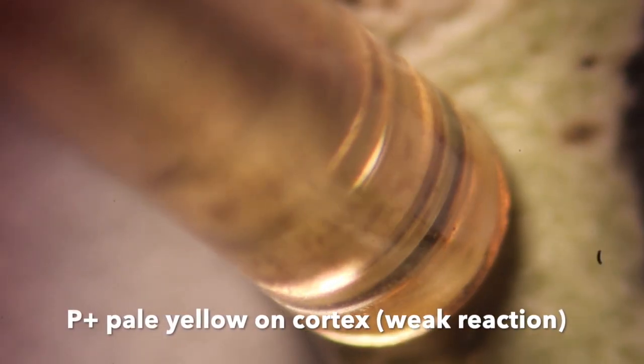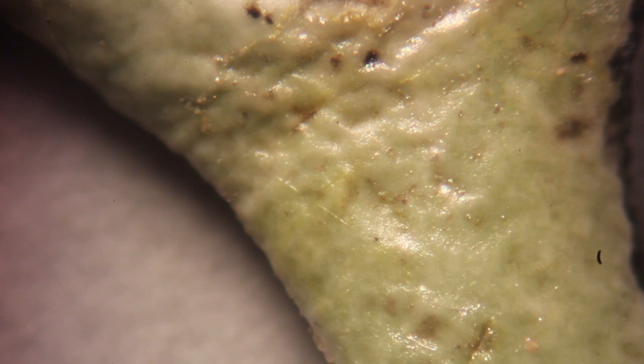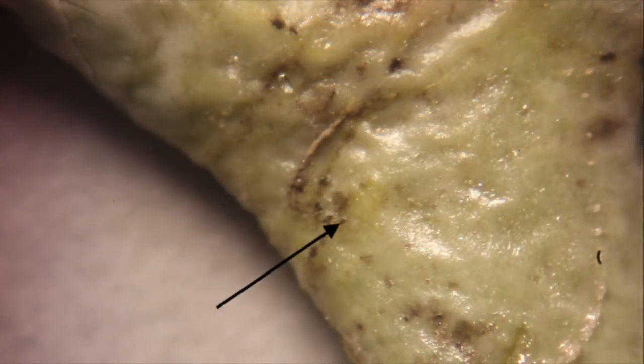Some reactions are weaker than others. In this case, we have a P plus pale yellow reaction on the cortex. Did you see it? Look here. Now try looking for it again.